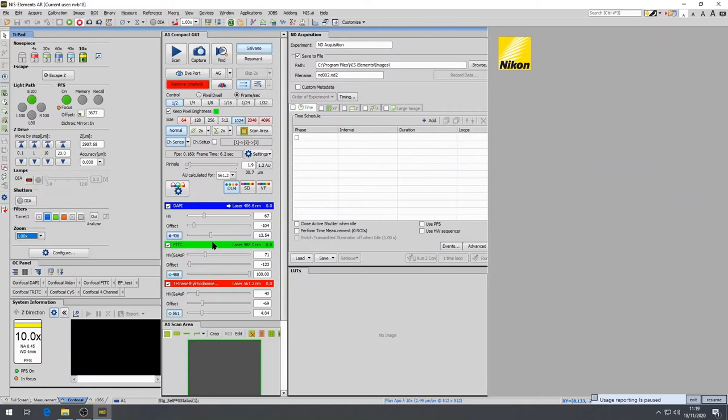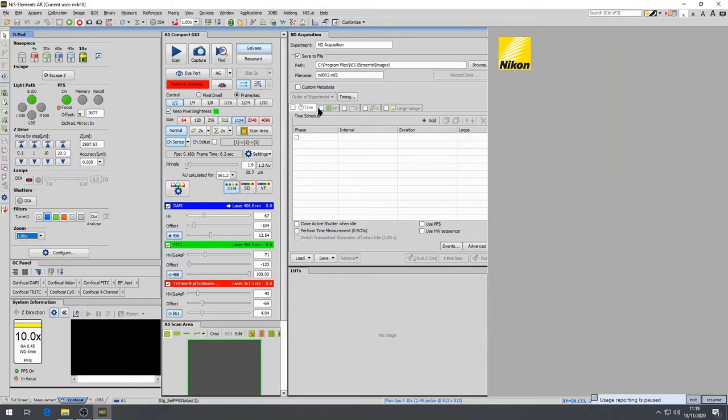Another window which is important is the ND acquisition. This panel is used to perform multi-dimensional acquisitions including timelapse, z-stack, multi-points or large images also known as tile images.